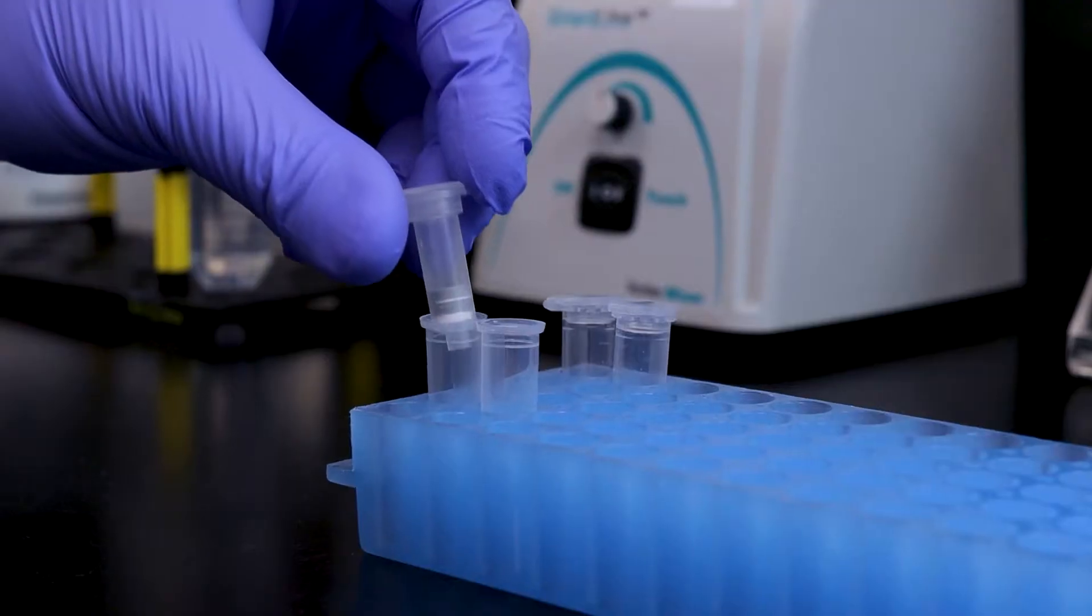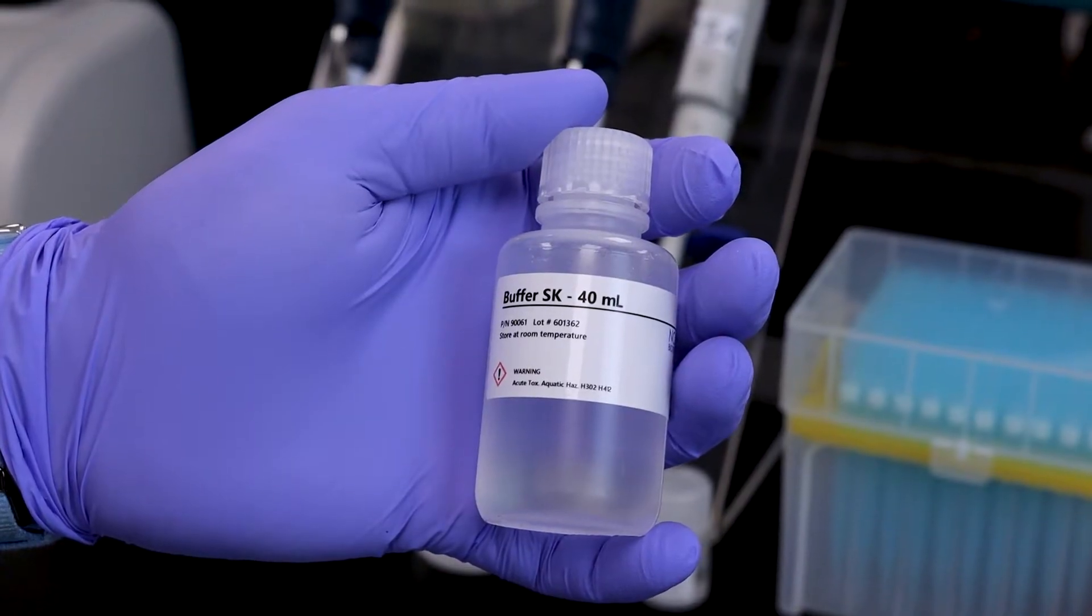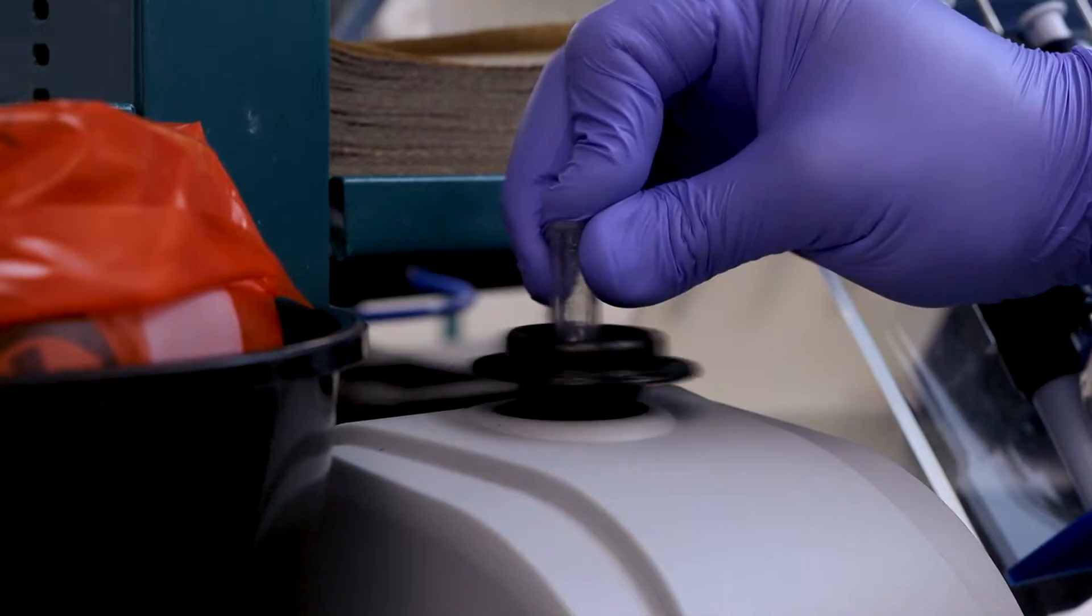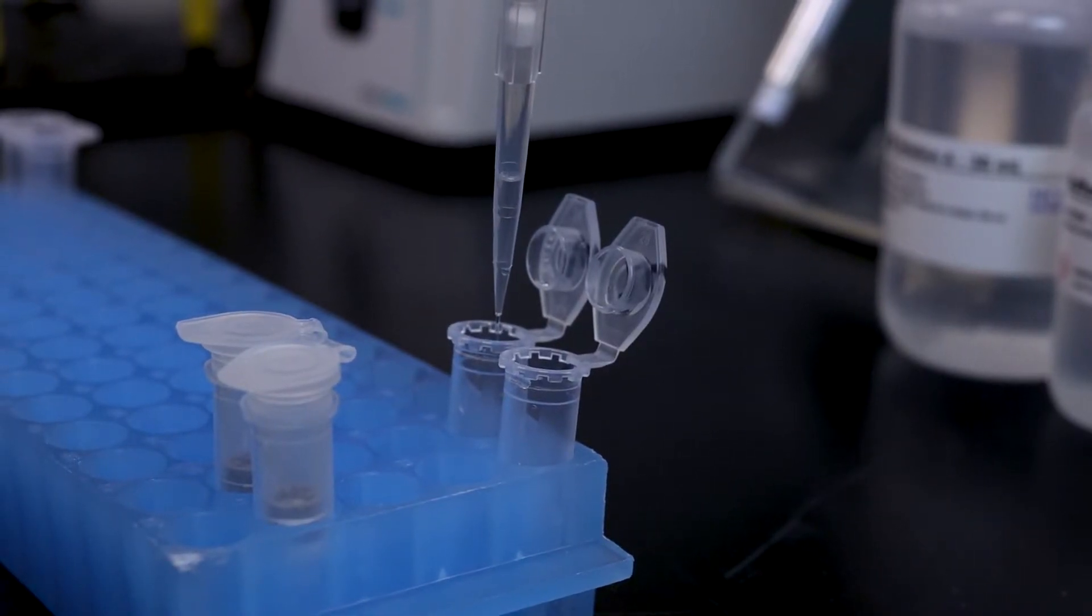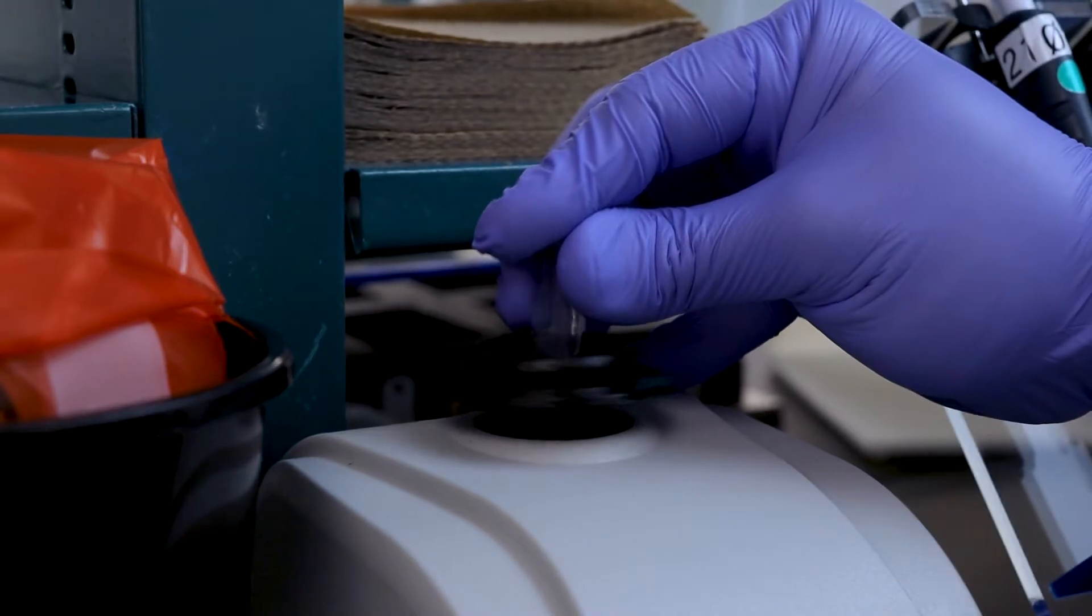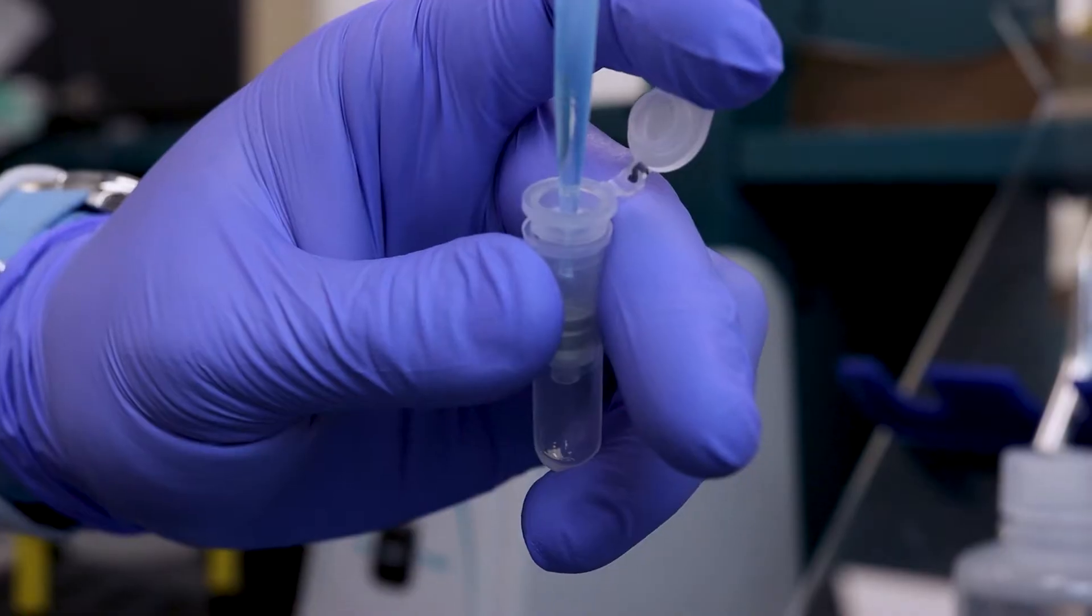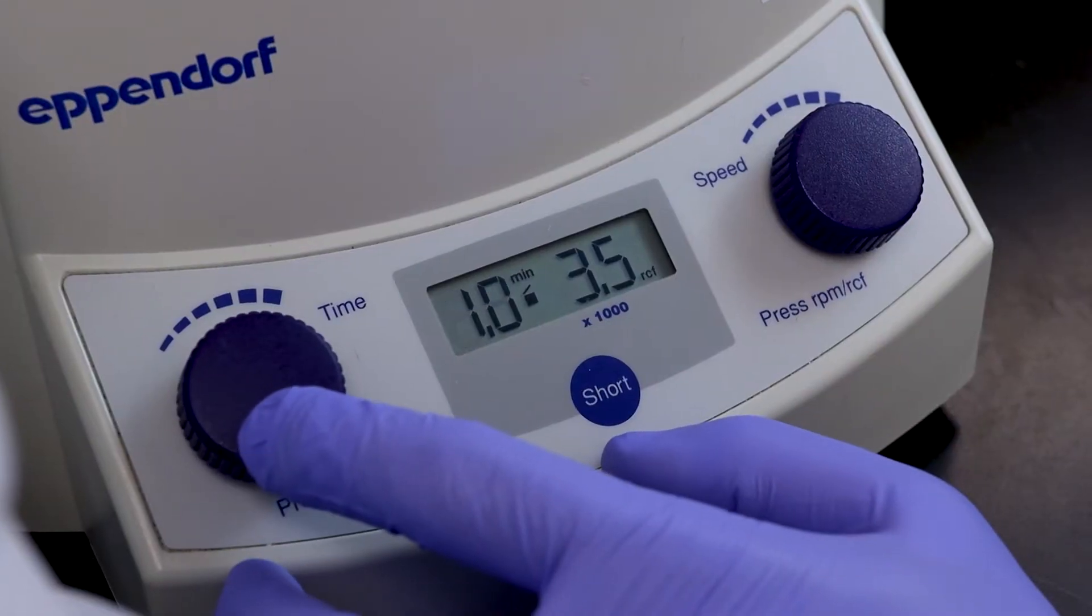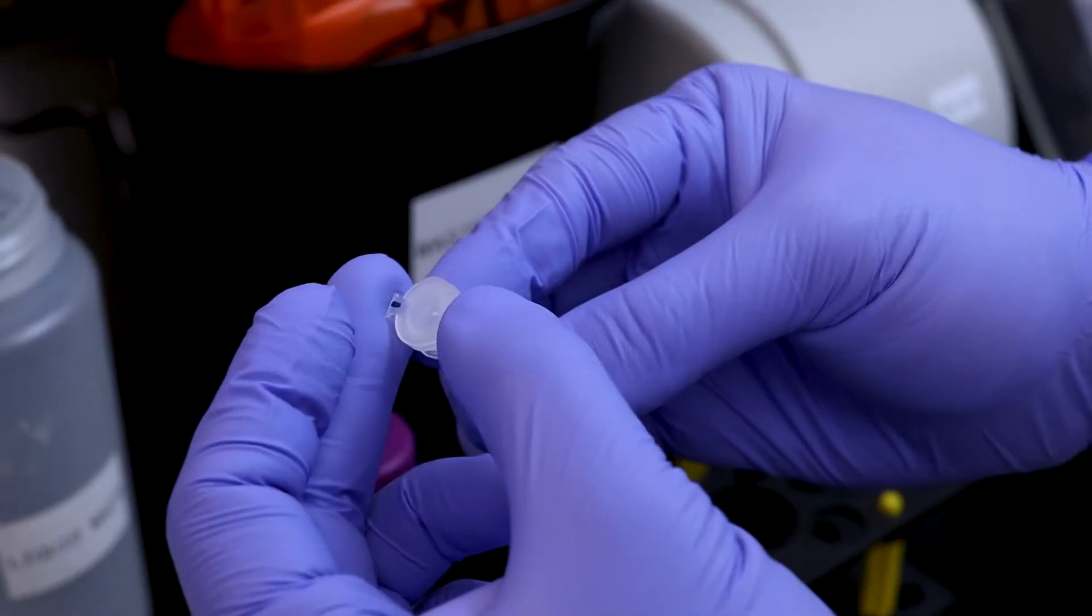Continue immediately to Step 2. Step 2a: Binding cytoplasmic RNA to the column. Add 200 microliters of buffer SK to the supernatant cytoplasmic RNA fraction from the previous step. Mix by vortexing for 10 seconds. Add 200 microliters of 96 to 100% ethanol to the mixture. Mix by vortexing for 10 seconds. Apply the mixture onto a spin column assembled with a collection tube. Centrifuge for 1 minute at 3500g or 6000rpm. Discard the flow-through and reassemble the spin column with its collection tube.